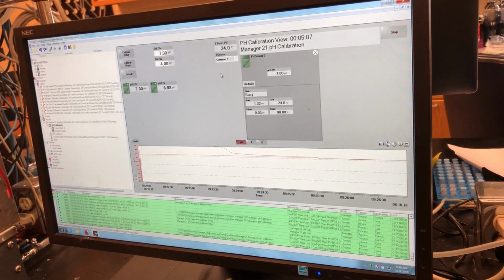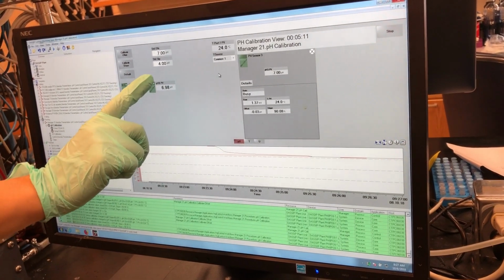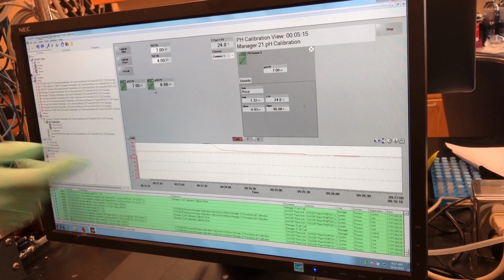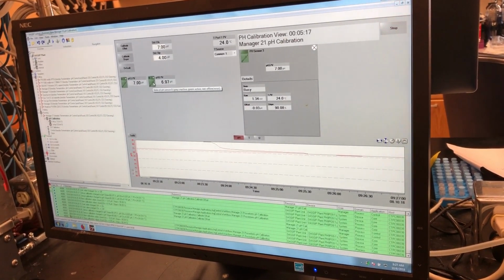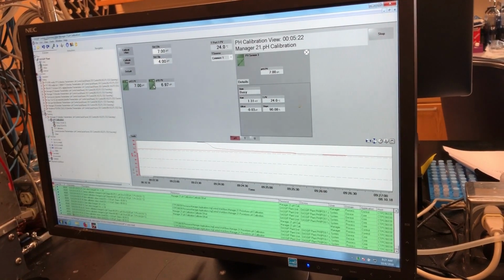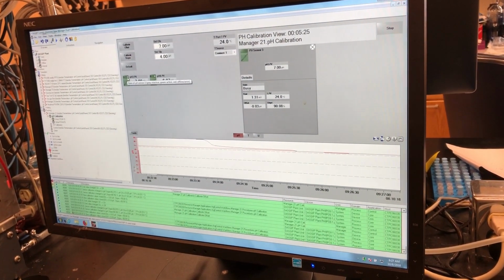So this means, yes, you make it 7, and then here is 7, let's accept. But if you make it 7, and here is far away, lower than 7, what do you do? Yeah, so if this one does not get to 7, typically when they turned yellow just then, when I hit calibrate offset, that meant that they were trying to move to 7.